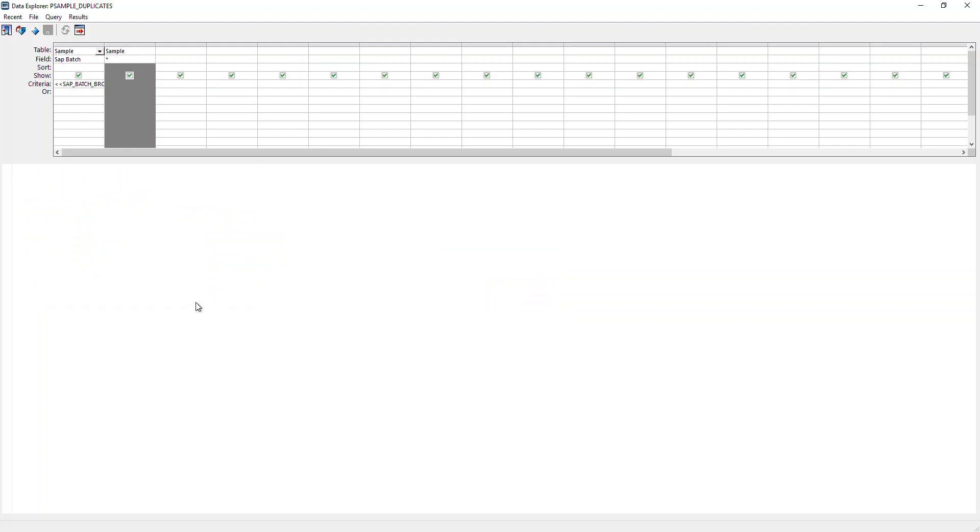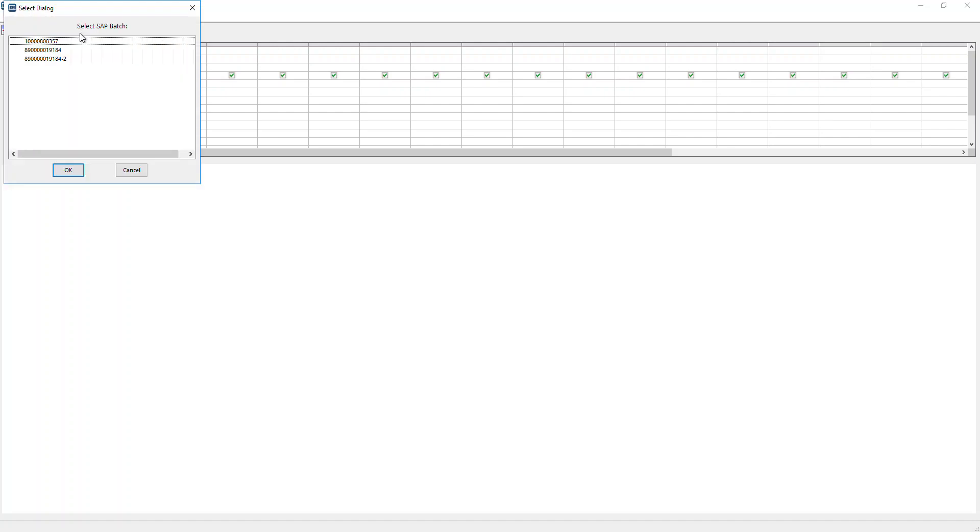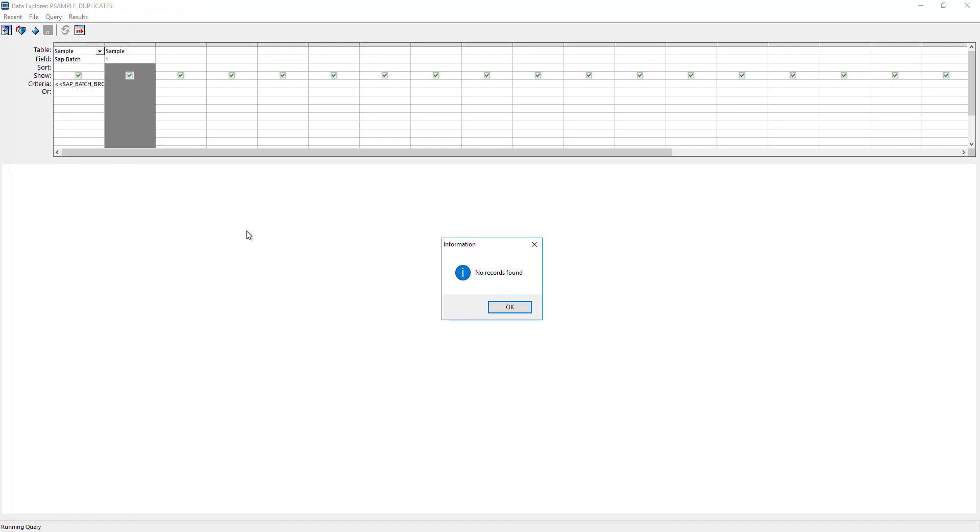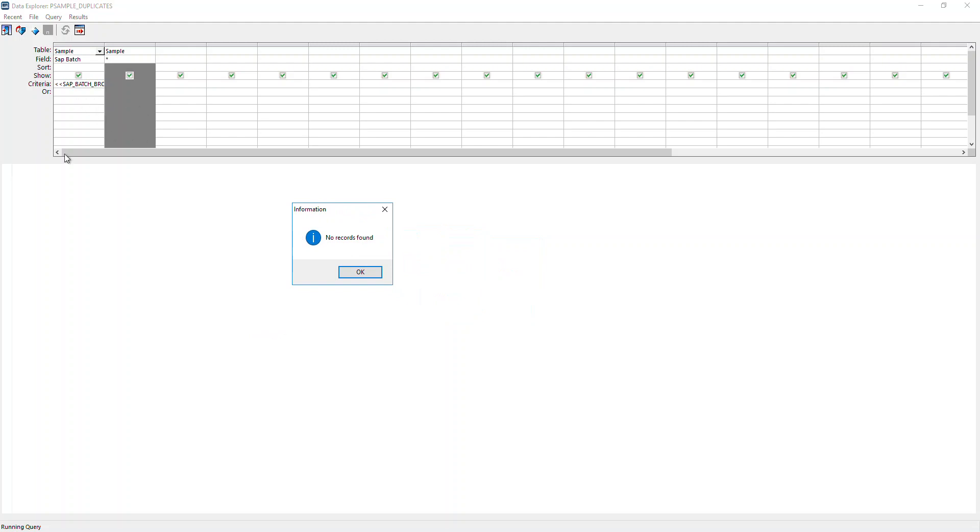I'll use Open Query, search for my query. I want to run my P sample duplicates. It's going to tell me which samples have duplicates. Once I hit Run, it's going to ask which set of SAP batches do I want to look at. This is the one I just logged, so I choose this.